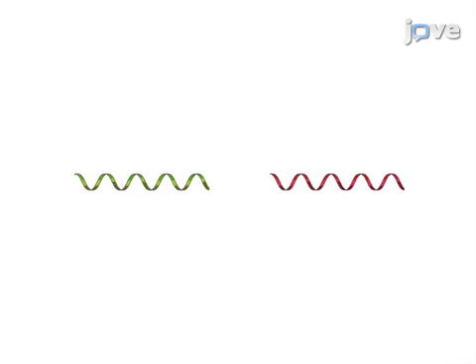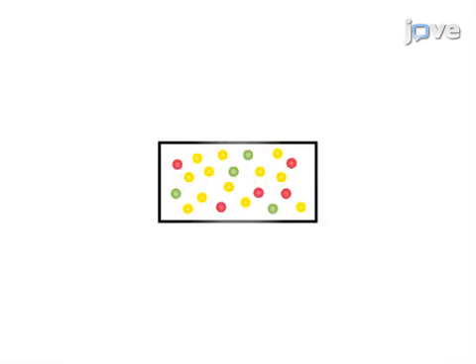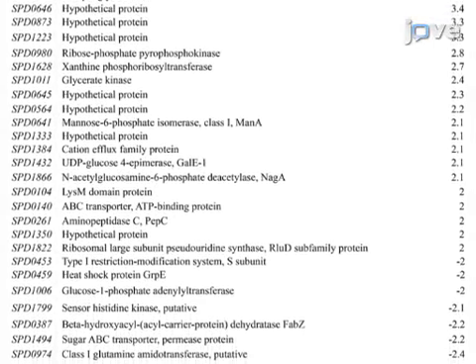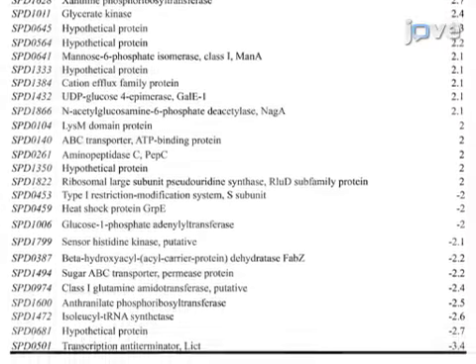Then, the cDNAs are labeled and hybridized to in-house made microarray slides. Finally, the slide is washed, after which the slides are scanned and analyzed. Ultimately, the microarray is used to show the transcriptomic changes in bacterial cells under the specific condition.